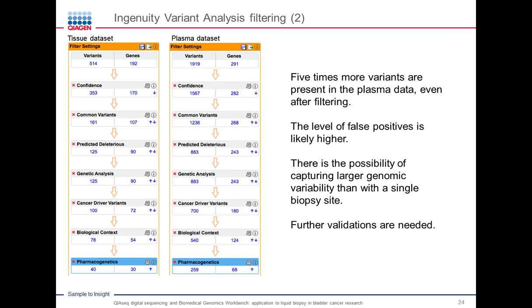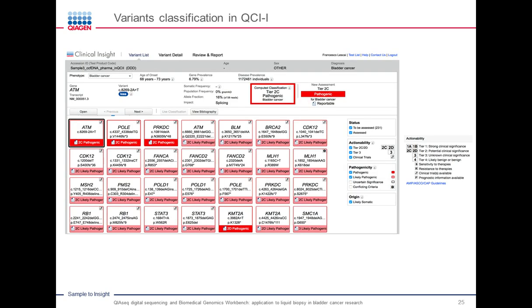But at the same time, there is the possibility that we are actually doing what we are supposed to do, which is capturing a larger genomic variability than the single biopsy site can. And of course, further validation is needed, but it's worth investigating further what's present in these variants. And we have done that by using the very powerful approach that is present in the Clinical Insight interpreter.